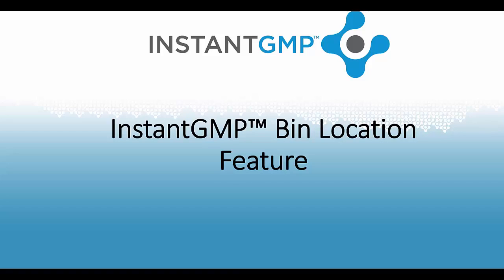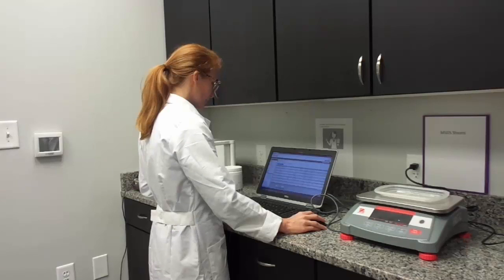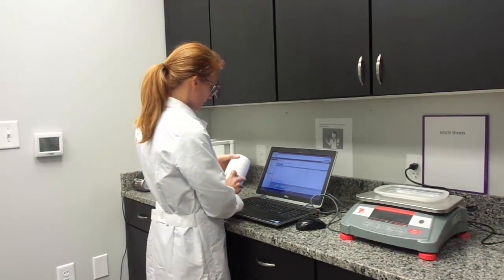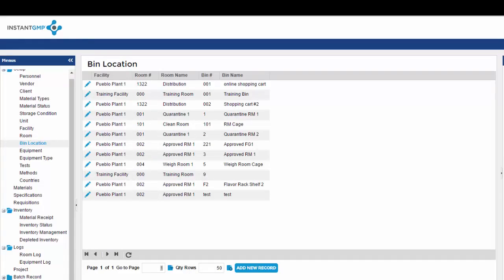Bin locations allow for quick tracking and traceability of raw or produced material locations. You can track your incoming materials as well as any in-house manufactured WIPs and finished goods. Bin locations are numbered and named static locations for materials in your facility or multi-facility company.